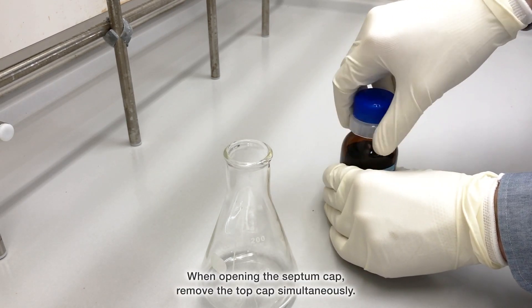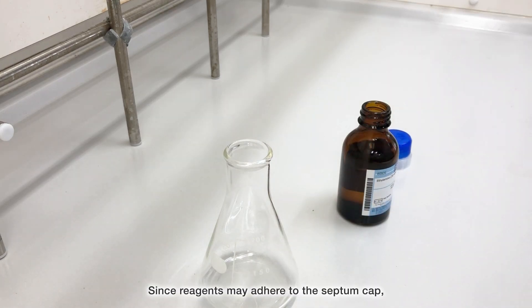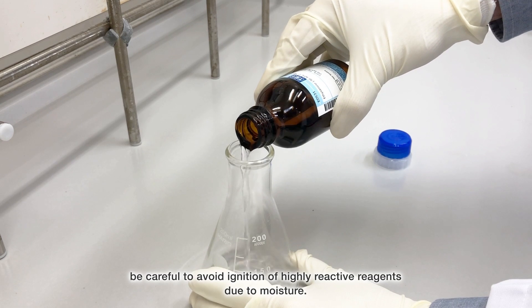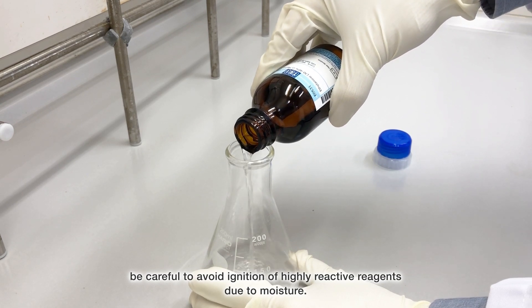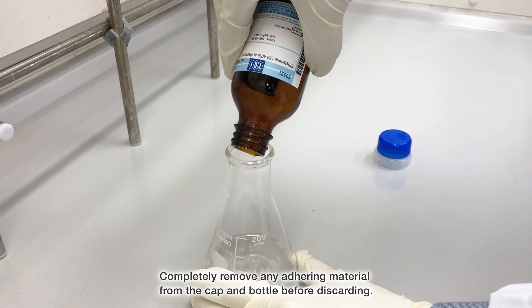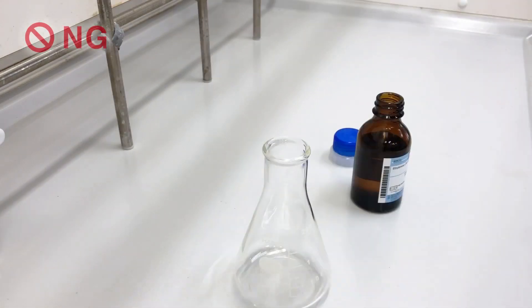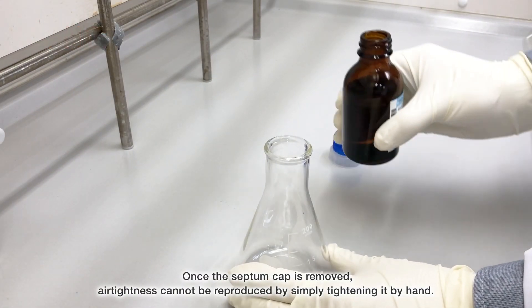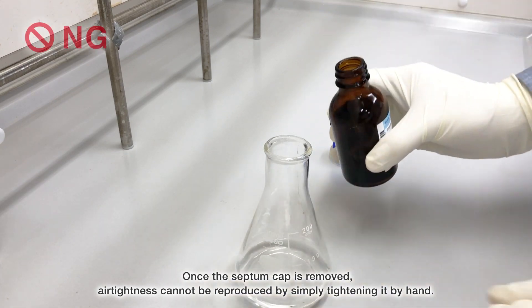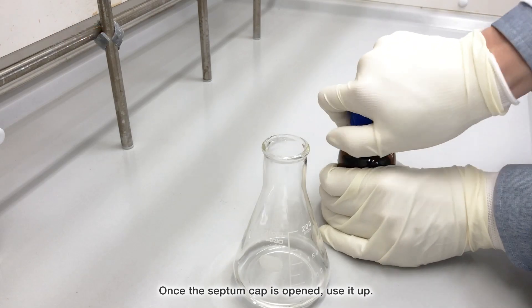When opening the septum cap, remove the top cap simultaneously. Since reagents may adhere to the septum cap, be careful to avoid ignition of highly reactive reagents due to moisture. Completely remove any adhering material from the cap and bottle before discarding. Once the septum cap is removed, air tightness cannot be reproduced by simply tightening it by hand. Once the septum cap is opened, use the reagent up.